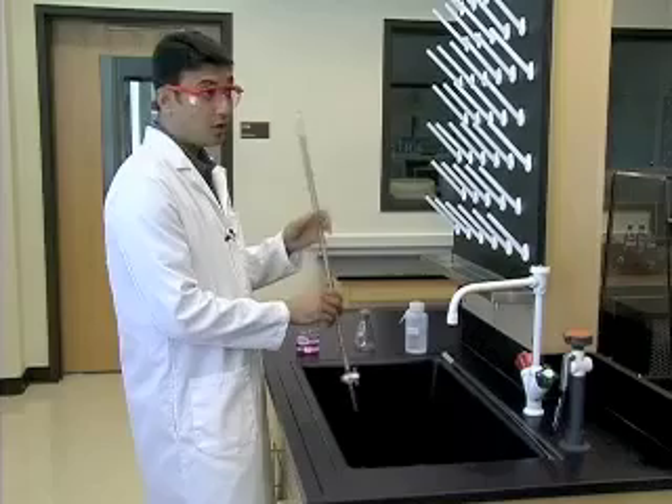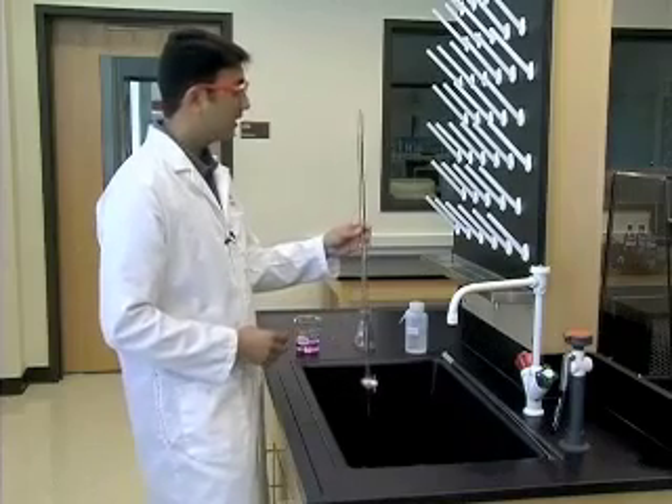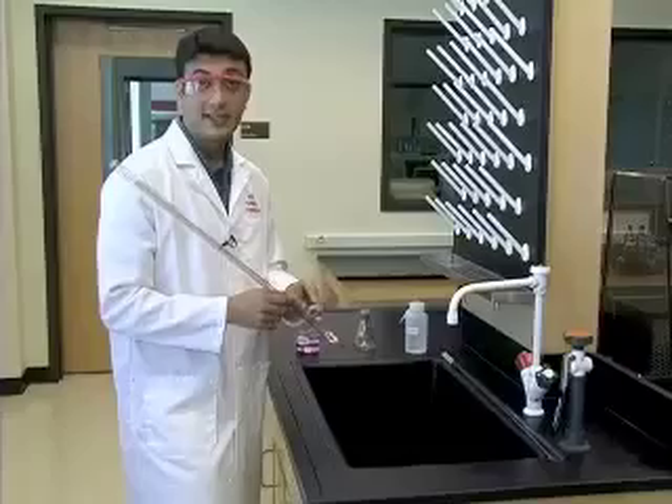Once this is done, we're going to walk to the bench to clamp the buret upside down to ensure that it's dry and ready for the next lab experiment.